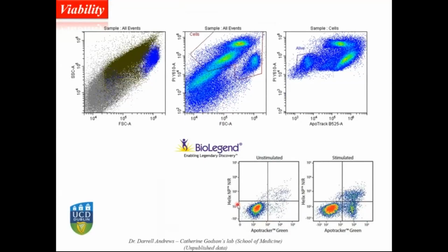But when we look at the live cells, and I was looking at the different populations, it didn't make sense. And I told her, look, for me, I'm looking at your kinetics, we are talking about different things. This is not behaving the same way as they show here, and it's not behaving in the same way as the typical annexin 5 profile. So what we can see is that we have live cells here.